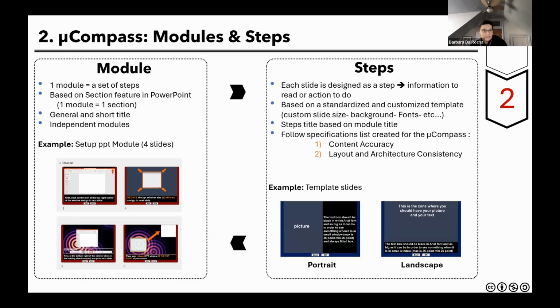Now, how the steps are designed. Each step is in fact a slide, and each slide is either information to read or an action to do. To have something standardized, we have based everything on the same templates with the same background, same fonts, and so on, so that it's easier to duplicate and create steps. For the architecture in the background, the title of each slide should be linked to the title of the section of the module.